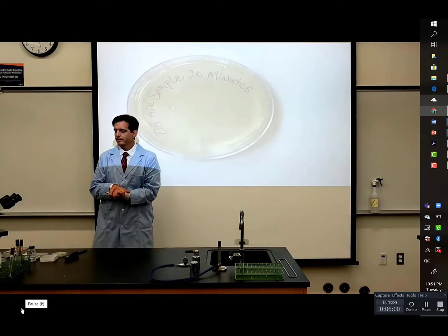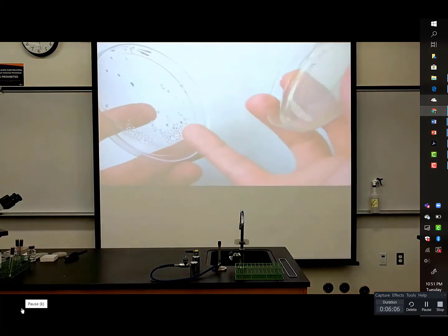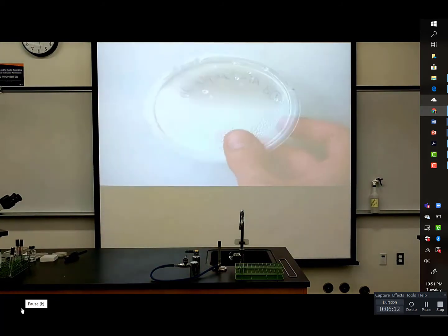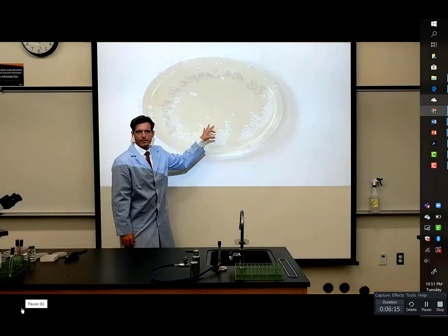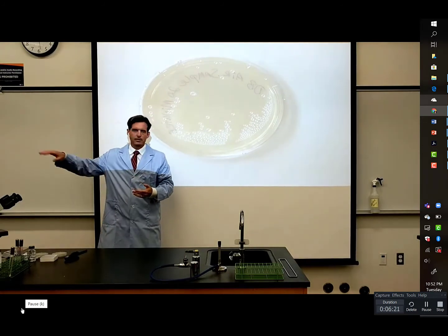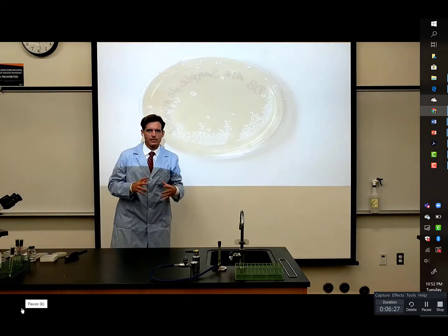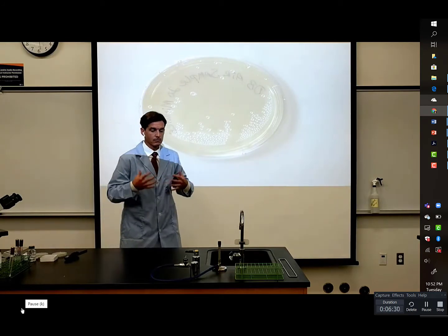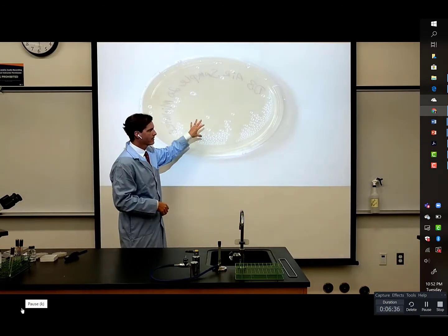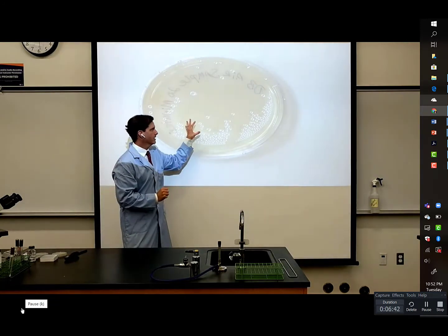And the reason is because of the condensation that I was showing you. See how here there are water droplets. Those water droplets, they'll build up more and more if we incubate the plate this way. Because when you put the plate into this gray box that I'll be showing you, the incubators, I'll put them on camera in a bit. What happens is the plate heats up to a nice toasty 37 degrees Celsius, which is actually human body temperature, coincidentally. And what happens is the agar that's on here, the jelly-like substance, has a lot of moisture, and water will come up out of that, and it will collect on the lid here.